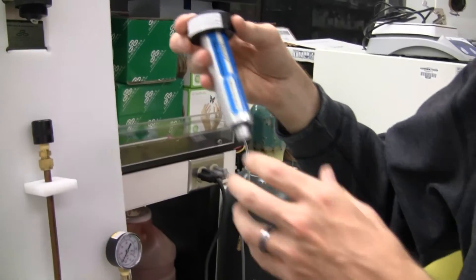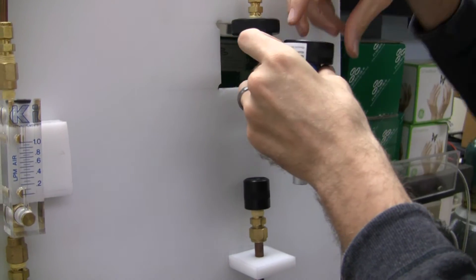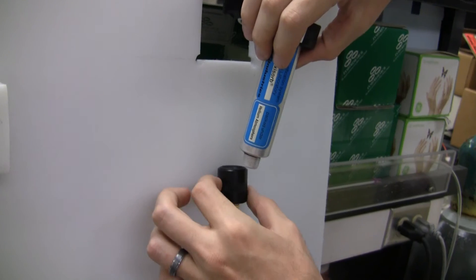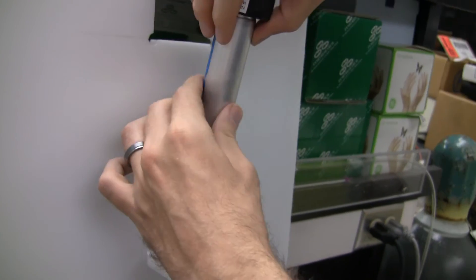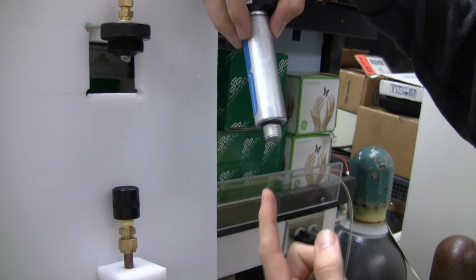What you're going to want to do is take this and screw this down onto this nut. Screw it down there and then you'll have a needle inside which will puncture the aluminum.